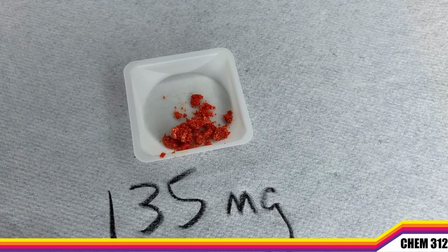Again, we started with our aminophenol as a brownish powder, and our salicylaldehyde was a clear solution. When they reacted together, we get this bright orange solid. One of the big questions of this lab is understanding and explaining why the changes to the chemical structure lead to a change in the color that we observe for the sample.